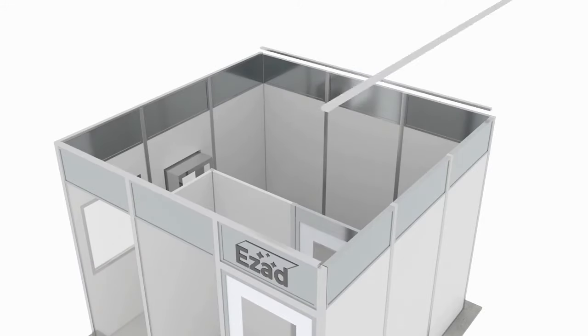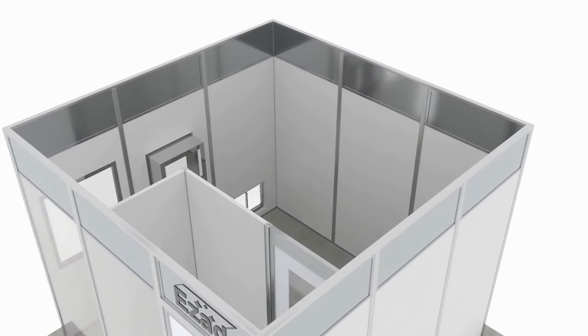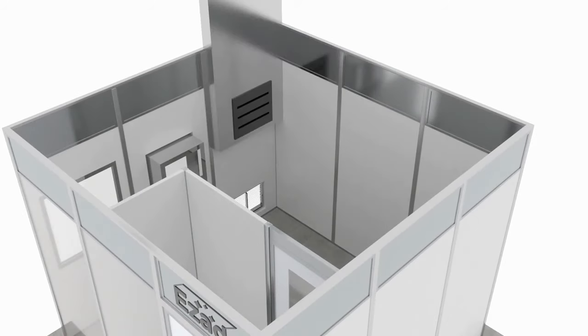Power outlets, data receptacles, and light switches are pre-wired and built on the post frames.